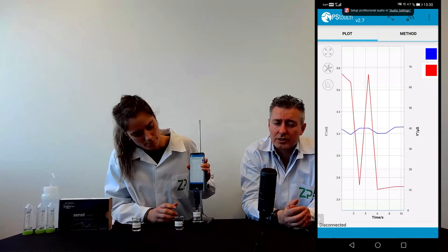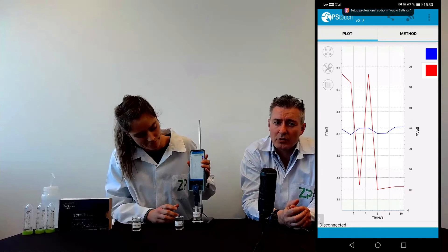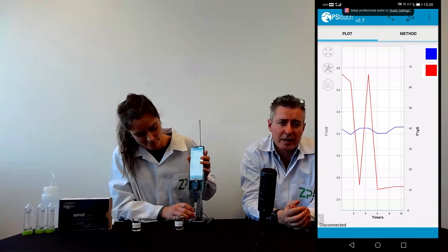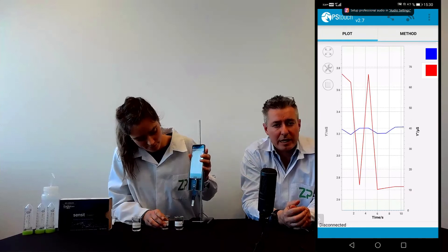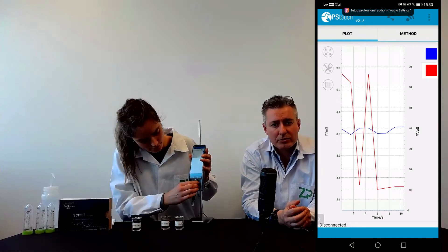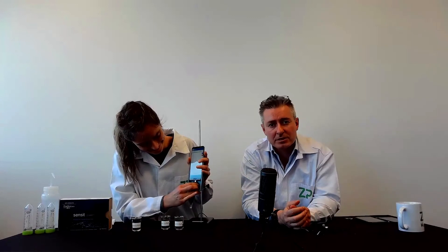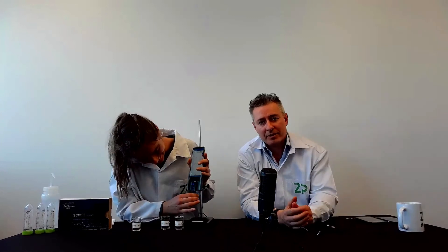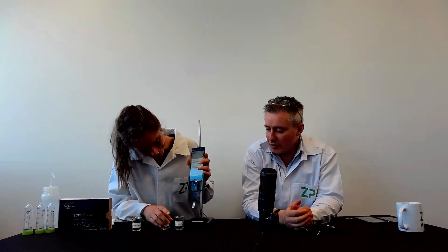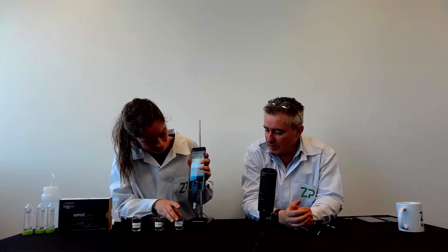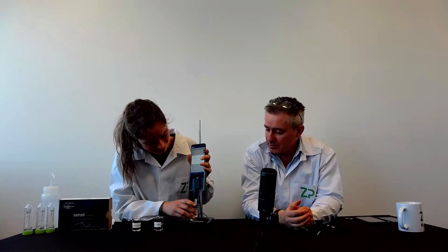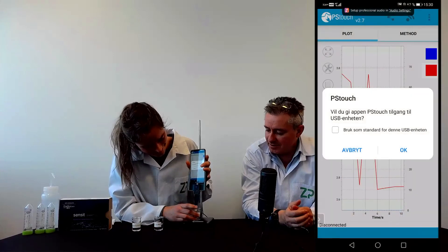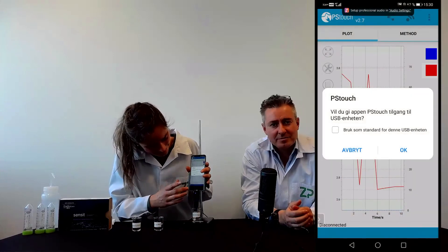Running the 10-second impedance spectroscopy measurement for 11 mM NaCl, then swapping to conductance view. The conductance is approximately 3.2 mS = 3,200 µS. Multiplying by 0.5 for the cell constant gives approximately 1,600 µS/cm conductivity — higher than for the 2.67 mM solution, as expected. Martin notes that Solrun's background is in quantum chemistry, which explains her excellent mental arithmetic.